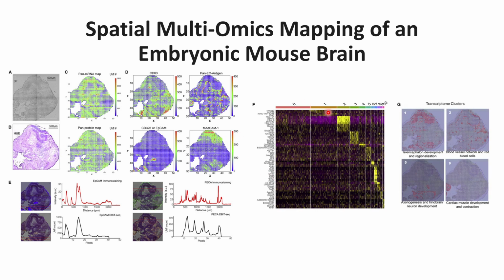And thereafter they cluster this whole results. They cluster the results from the DBiT into 10 clusters. They cluster the transcriptomes that they obtain from the DBiT into different clusters, and when they do the spatial clustering, four different groups have been identified.